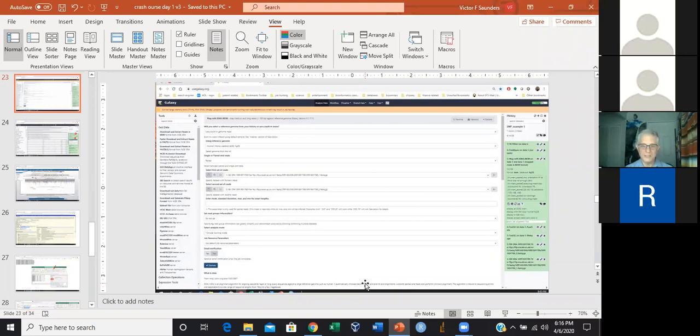And with that, it's just a matter of finding where the pieces overlap and getting enough of the pieces to overlap that you can generate long continuous sequences. And then once you've generated long continuous sequences, you make those overlaps overlap until you can get as much of the genome as you can. You may never get all of it, but you can get most of it.